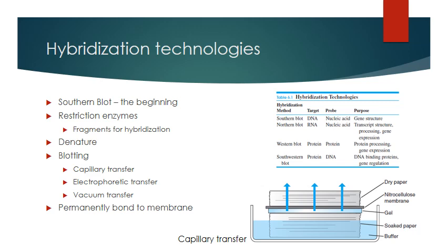In the final steps, this is where the hybridization comes in, the DNA fragments are exposed to a labeled probe of a specific sequence that we know. It would be complementary to the target sequence, so if that target sequence is there, you'll have bound probe in the regions of interest. Any unbound probe can be washed off, and then the signal of the probe can be detected to indicate the presence or absence of the sequence you're looking for.